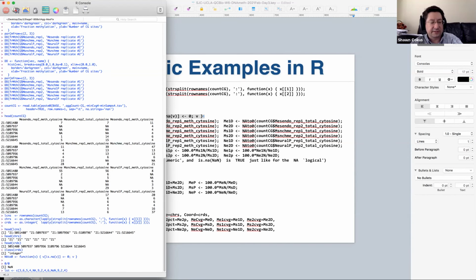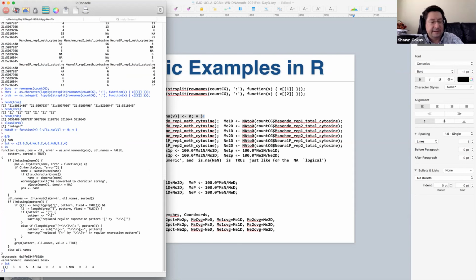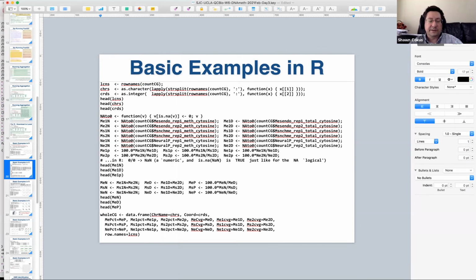Let's see if this works. Okay, so list is this. Yeah, that's the actual code. All right, LST. Actually, that's the code for LS. I lost the T and it showed me the source code for the LS R function. Okay, anyway, here's my little list, and if I run my little NA to 0 on this guy, what comes out? It works great. So that's a little guy that we can feed vectors, and it'll give us NAs replaced with zeros.